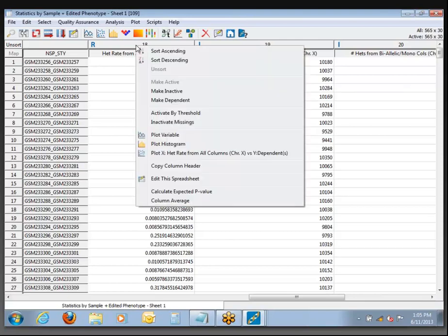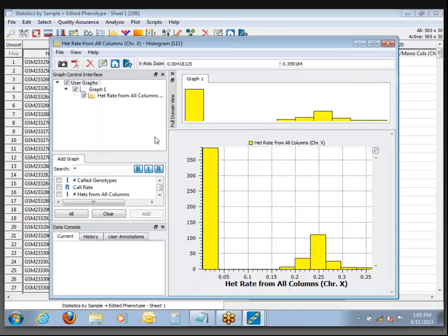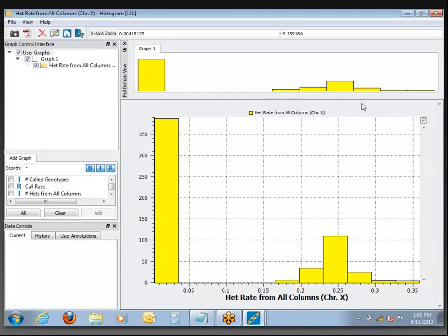From this column I want to create a histogram just like we've already done — so click Plot Histogram. When I do that I see the expected distribution where over to the left is where all the males should be with a very low heterozygosity rate on chromosome X, and to the right we have a more scattered distribution of females with a lot of heterozygous genotypes on the chromosome.